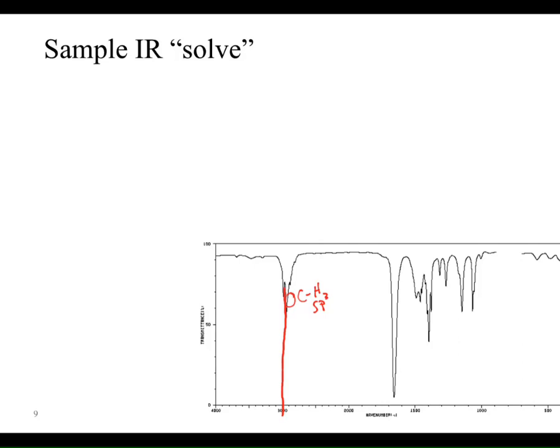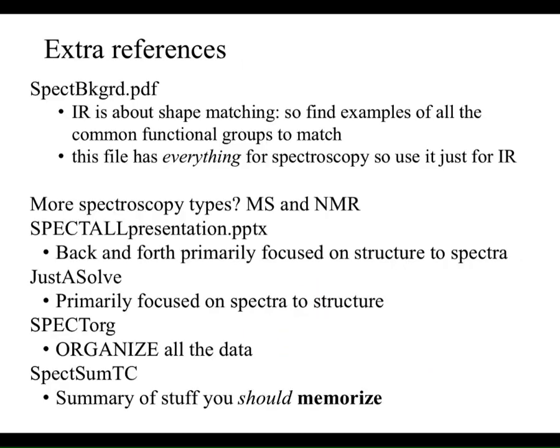And then here's where some people can kind of freak out. I might write CH sp2. Notice I'm writing it in a different color because I'm going to follow this with a question mark. Okay. So if I'm going to rely on analysis, I'm not going to base my answer on that being a CH sp2. I'm going to say maybe it's a CH sp2. I don't really know. Okay. Last one. This shows up 1650, 1700. This is a carbonyl, carbon-oxygen double bond. And done.